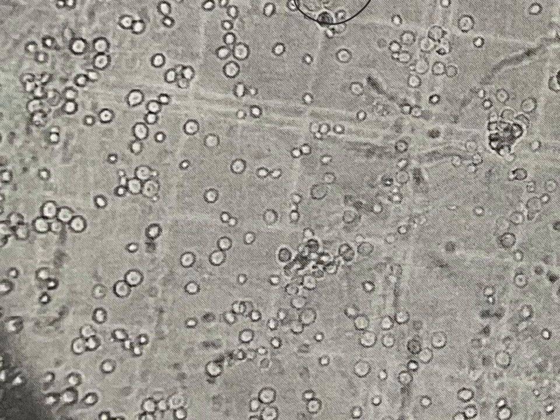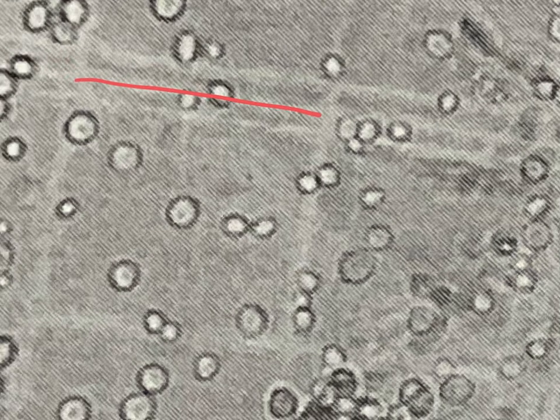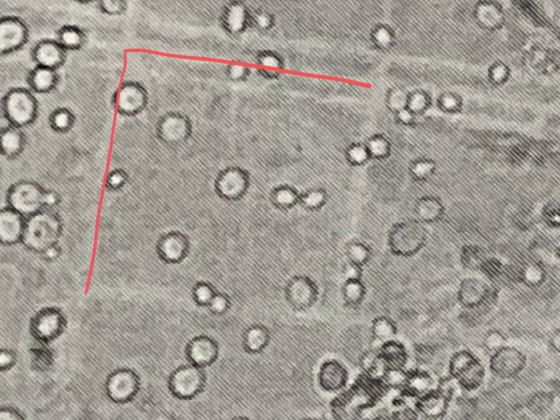For example, pick a square. If I pick this square here, if you can see 3 lines there, in that case, you take the middle line. Okay. So basically, you just outline your square. Now you need to be careful how you draw that. And then you count your cells.